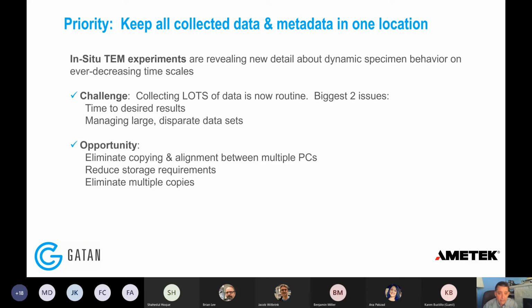Reduce or eliminate the copying and alignment between the multiple PCs. I think we're well along that path, particularly integrating the holders. Reduce the total storage requirements, either through inline or post-processing, and eliminate the need for multiple copies, so you can more efficiently use the hard drive storage space that you have.